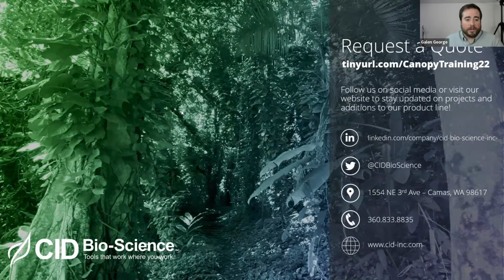The next question is how do we make sunfleck measurements? Sunfleck measurements are happening automatically. It is, as I mentioned, that threshold setting with the PAR value. So what you're doing is you're saying in a certain period of time, if I'm getting this level of PAR for a shorter period of time, then that is now going to be a sunfleck. That's something you have to define in the instrument and make sure you're getting an accurate measurement. But it's calculated automatically when you take a measurement.